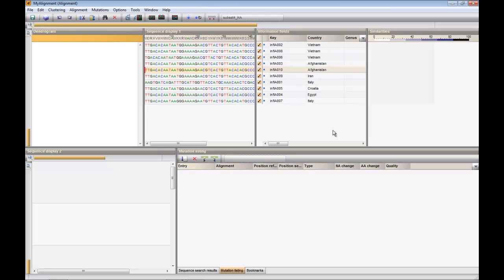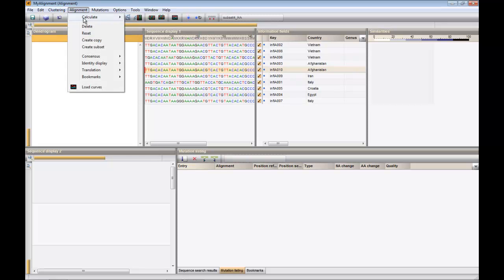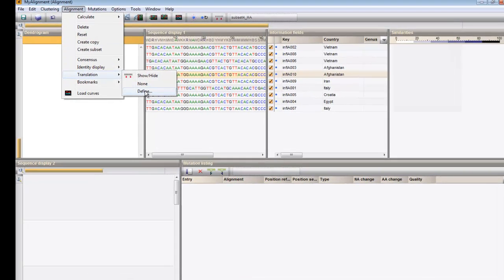The multiple alignment you see here was calculated with the default settings of the Bionumerics algorithm. The settings that will be used for translation can be specified under Alignment, Translation, Define.